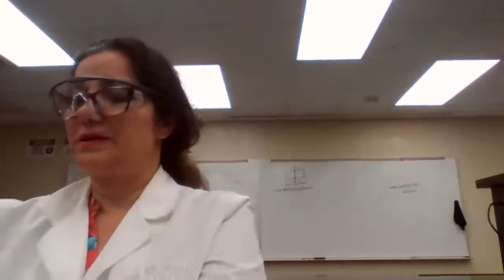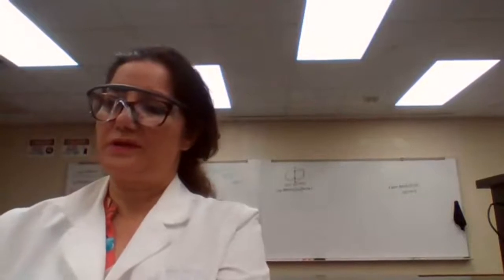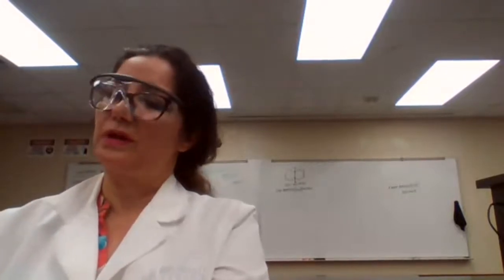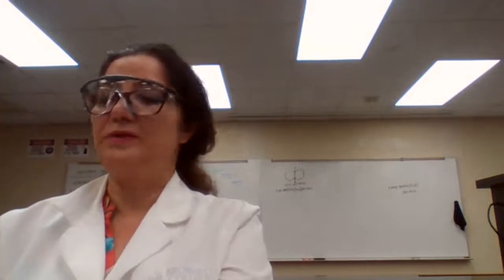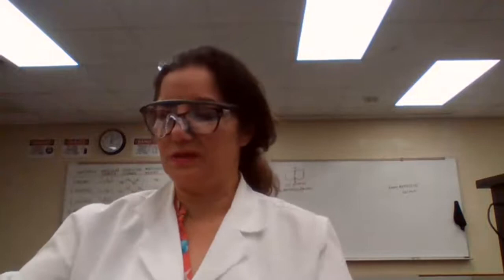Procedure for this experiment 3. First, we are going to start with measuring the mass of, let me just follow the procedure step by step, because you are going to have access to this procedure when you purchase your lab manual online, the ebook for the lab manual.